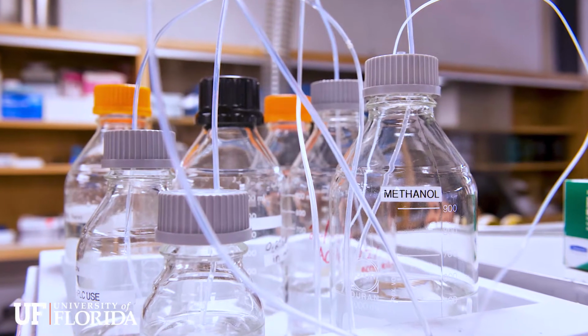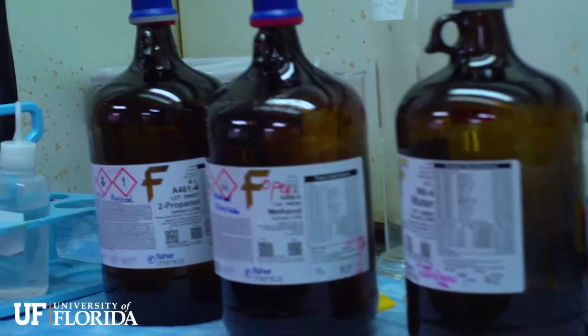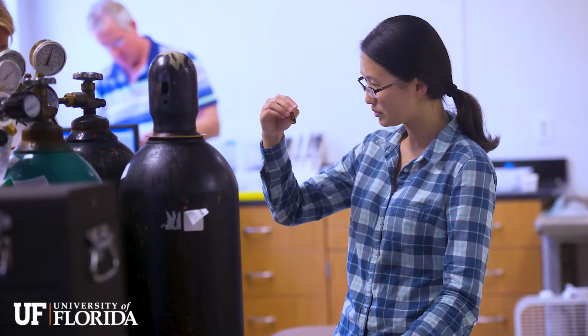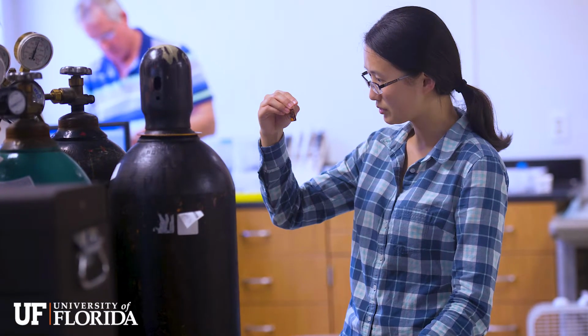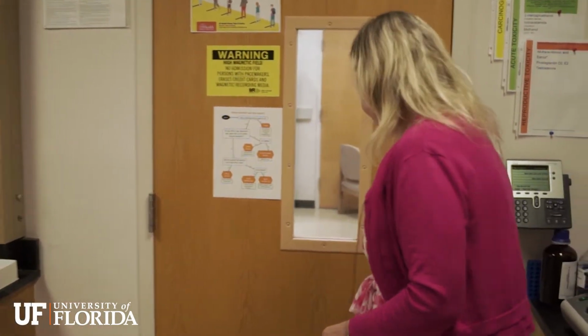Oh, I just want to pause here also. We do quite a bit of the preliminary sample preparation before mass spec. So we can do things like extract your sample from tissue, whether that be from cells or actual tissue, plant material. We can do all of that for you. We can also train you how to do that so that it is appropriate for mass spec analysis. We can do SDS-PAGE. We do quite a bit of the sample prep here for you if you want.